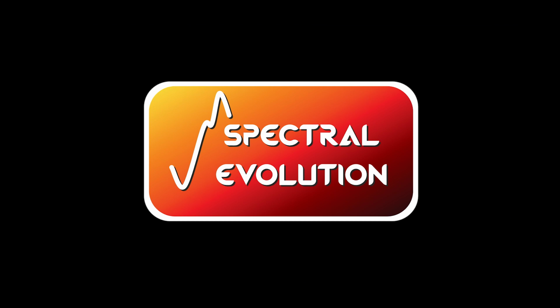All right, thank you, Mac. There's another question that came in about the classification that Mac was just talking about. Is there a way from the spectral data to do classification and identification? Yes, you can do that. With the naked eye, vegetation spectra all look similar, but they have some subtle variations in the absorption features that our software is able to detect.